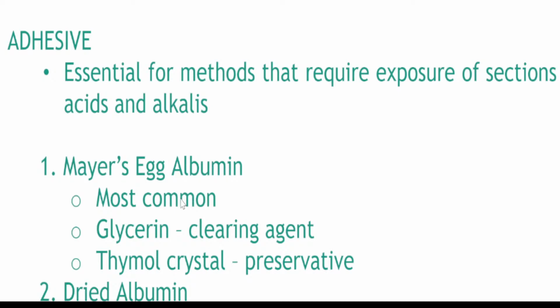You can raise your hands. Come on. Look at all of them. What's common among them? They sound like ingredients, right? Egg albumin, dried albumin, gelatin, starch paste.